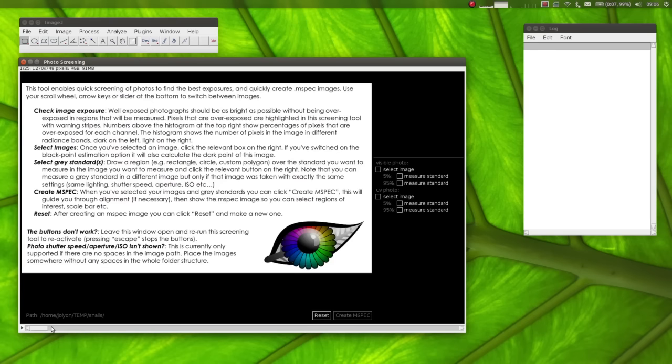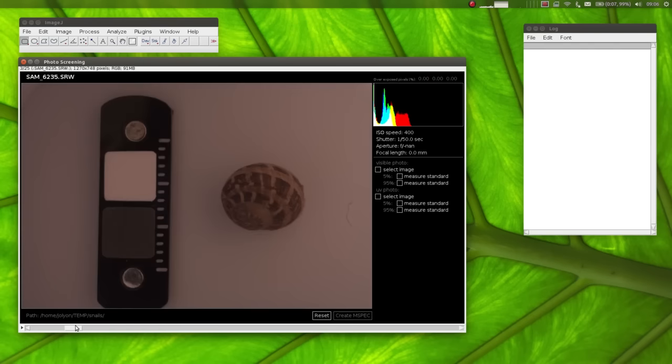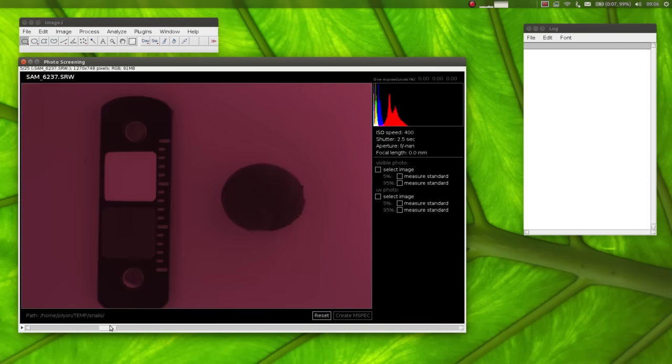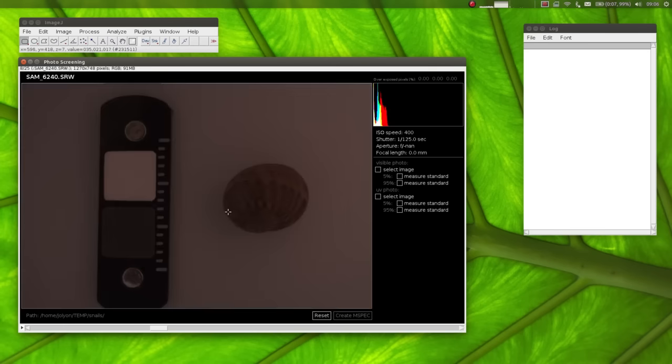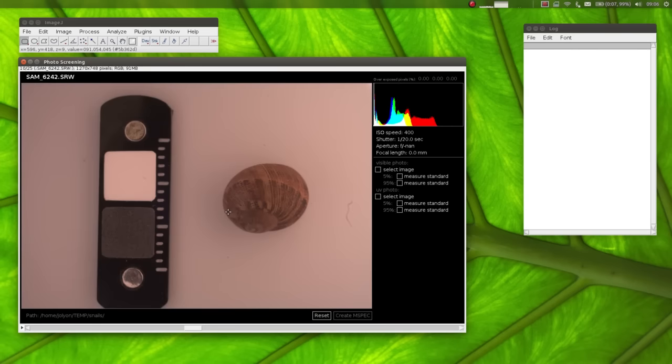So now I will just give you an example of how to make a multispectral image using this previewing software. So I've already made the first snail one. Another really handy thing that this screening tool does is it shows you where is overexposed. So you see the crosshatch red here. All of these pixels are overexposed, so can't be used. So this photograph is completely useless if we were measuring any region around here. The snail itself here isn't actually overexposed, so we could measure these values, but we couldn't use this gray standard because it's overexposed. And this image looks good.